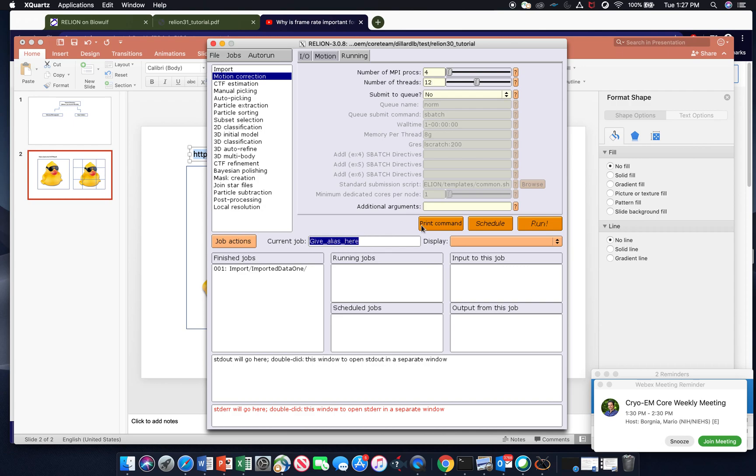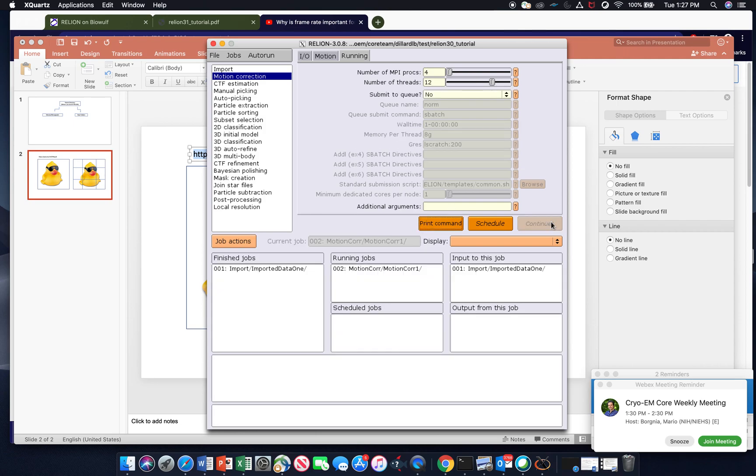So we're just going to call this MotionCorr1 and we will run that. And that's how you motion correct your data.